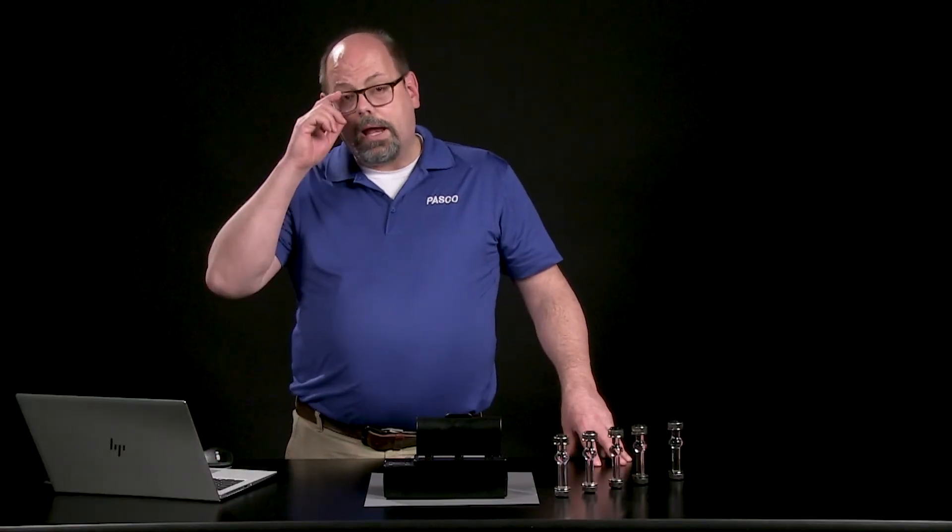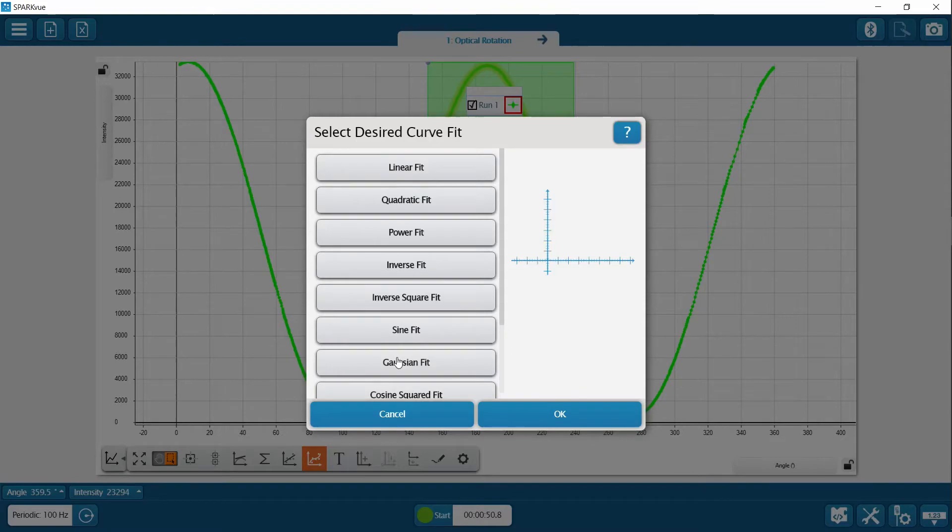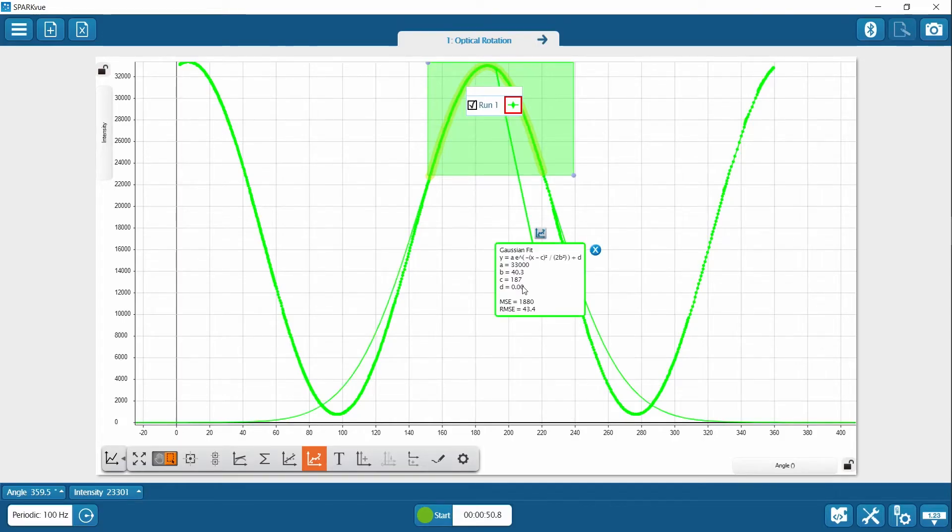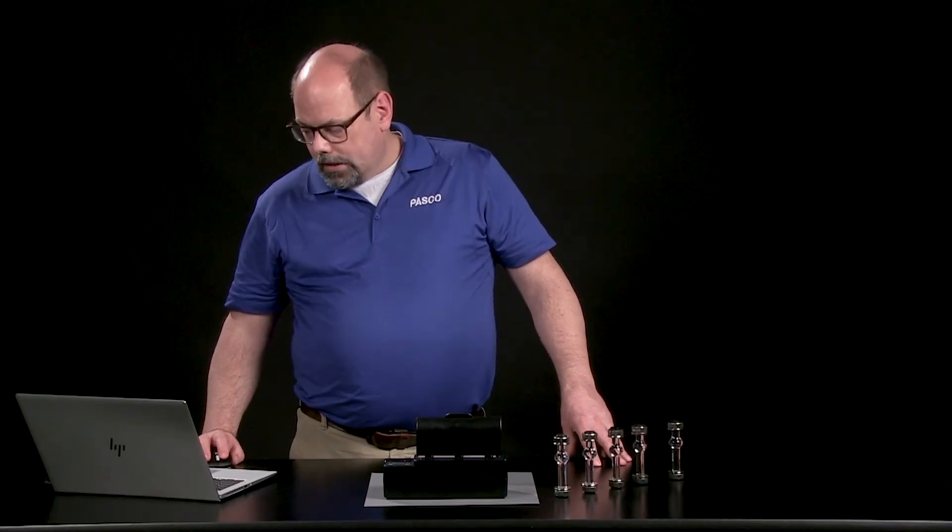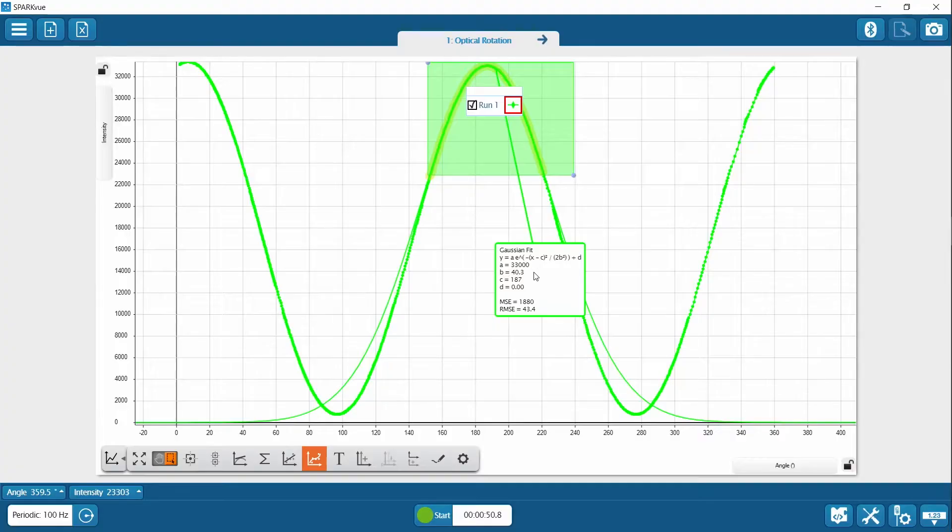You'll recognize Gaussian as the bell curve, a standard distribution. What's cool about the formula that comes up, the letter C, the term C is the center of that distribution, which is the peak of that wave. So you don't have to sit there and take the tedious detail to find that peak. We're going to use it as 187.